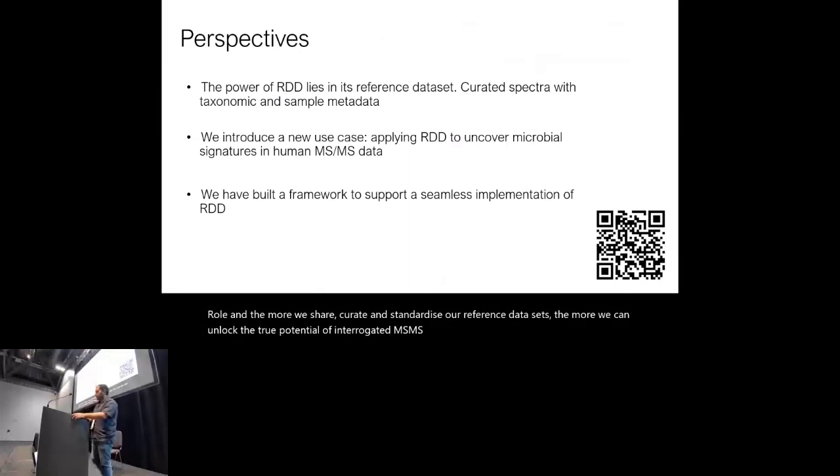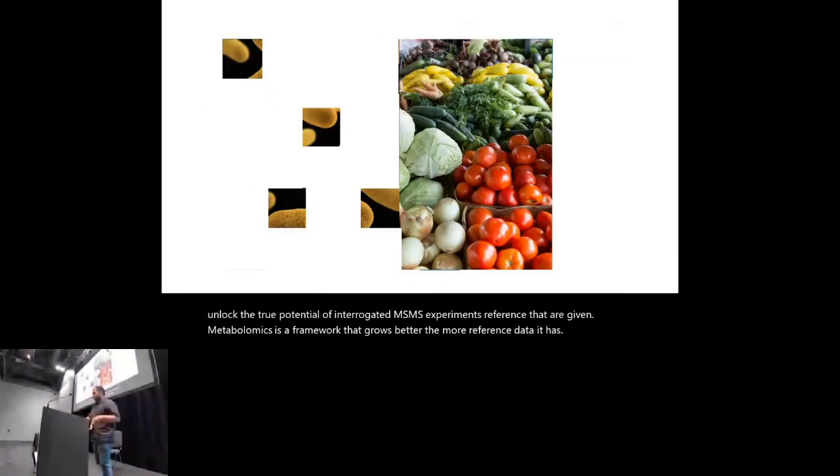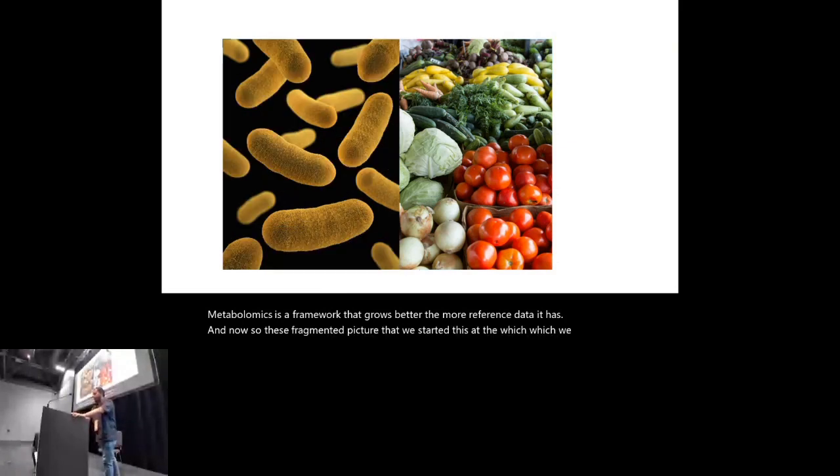Reference data-driven metabolomics is a framework that grows better the more reference data it has. And now, this fragmented picture with which we started becomes a clearer and more informative picture of our biological data.